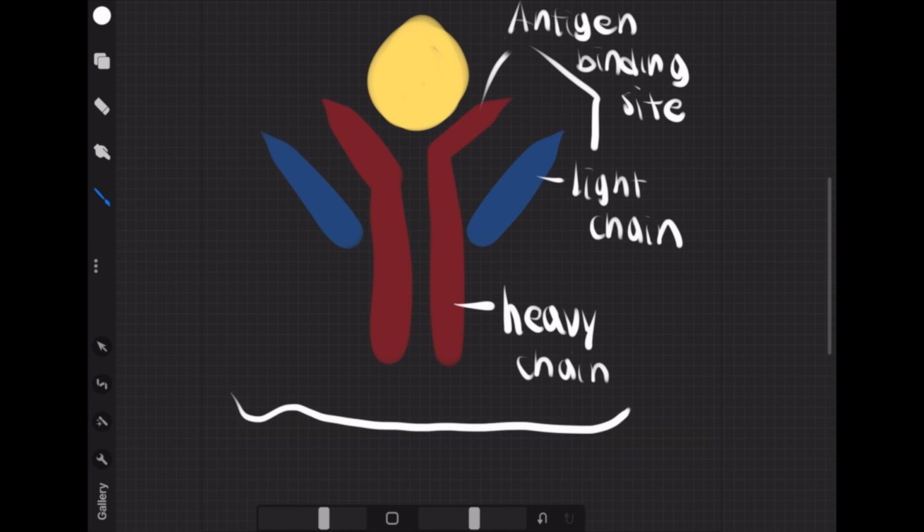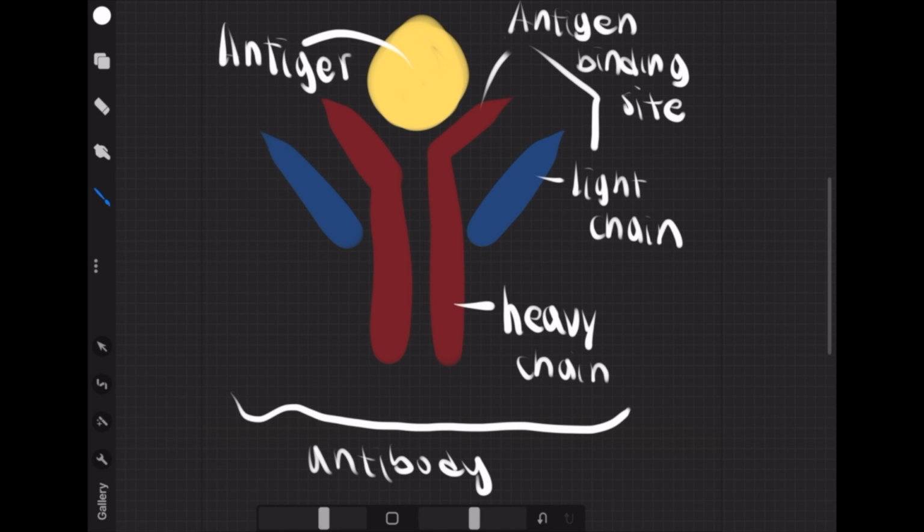The technique utilizes the specific interaction between antigen and an antibody. To detect the presence of the antigen, a detection system will be employed that is either conjugated to the primary antibody or secondary antibody that binds to the primary antibody. A detection system is used to quantify the amount of antigen present in the sample. The intensity of the signal will be directly proportional to the amount of antigen captured in the microplate.